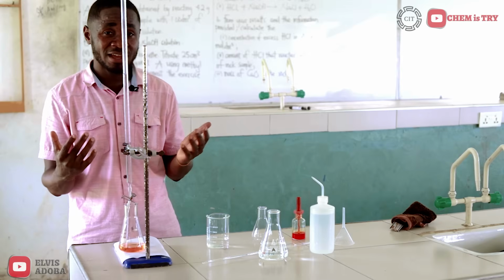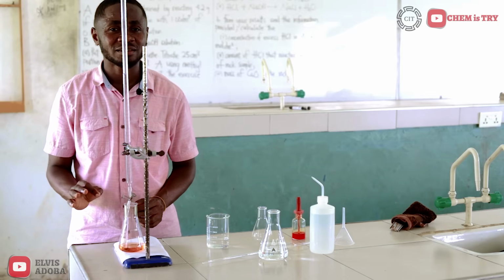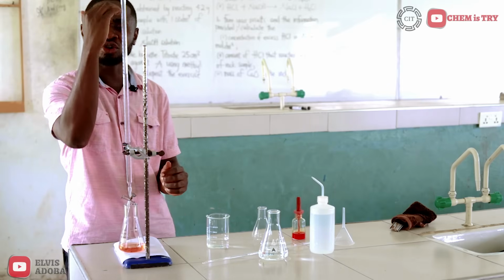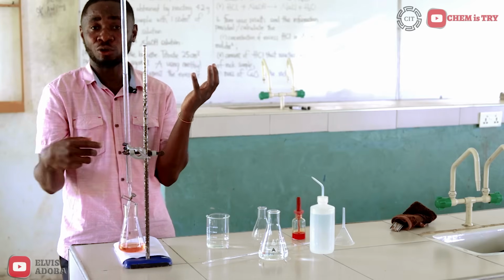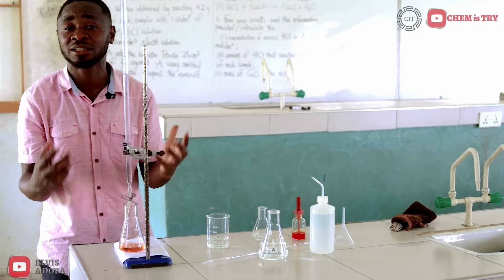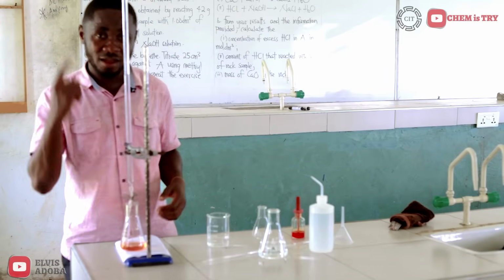There's a possibility that I have overshot my endpoint. So in performing my second titration, this is what I'm going to do. I'm going to pipette my base, add my methyl orange indicator, release the acid from 0 to around 16. Then I'll swirl. Then I'll go dropwise. Then I'll swirl. Dropwise, then I swirl until I catch my actual titer value. That is how I'm going to perform my second titration. And I'm supposed to get the actual titer value then. Let's see how it's done.